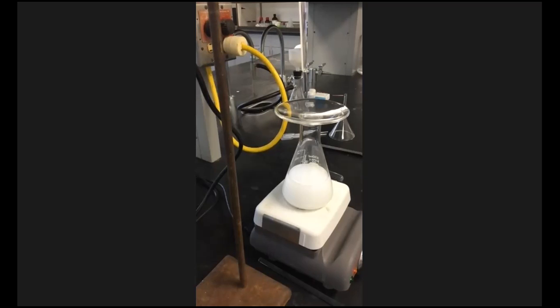And by the same token, if we added potassium oxalate and a little bit more precipitate came out of solution, it would tell me that there was none of that left. Because the limiting reactant, once it's gone, the reaction stops. So if you add more of what was limiting, then you get a little bit more reaction. If you do it again, you get a little bit more. But if it's excess, right?